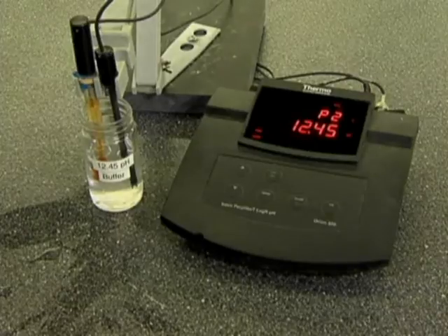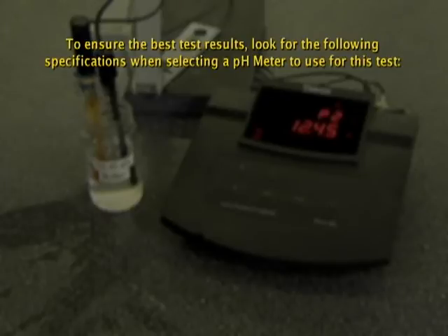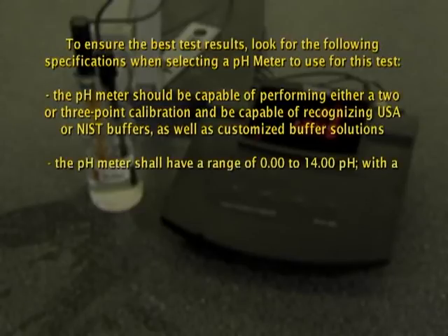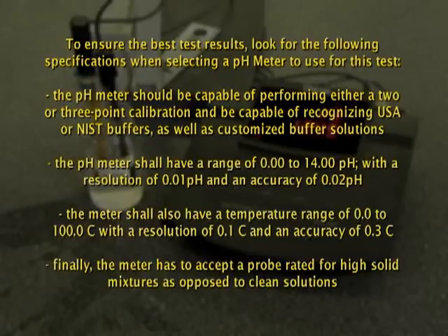It is important to note that not all pH meters are created equal, and many pH meters in the industry do not have the option of adding a customized buffer. To ensure the best test results, look for the following specifications: the pH meter should be capable of performing either a two- or three-point calibration and be capable of recognizing USA or NIST buffers as well as customized buffer solutions. The pH meter shall have a range of 0.00 to 14.00 pH with a resolution of 0.01 pH and an accuracy of 0.02 pH. The meter shall also have a temperature range of 0.0 to 100.0 Celsius with a resolution of 0.1 Celsius and an accuracy of 0.3 Celsius. Finally, the meter must accept a probe rated for high solid mixtures as opposed to clean solutions.